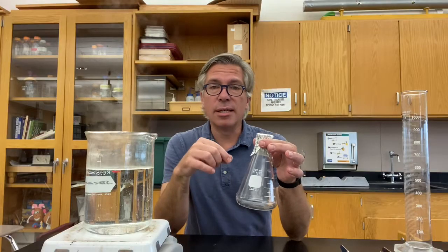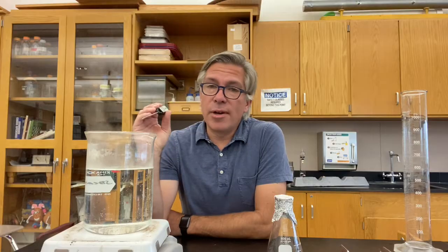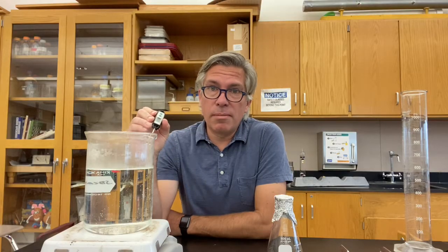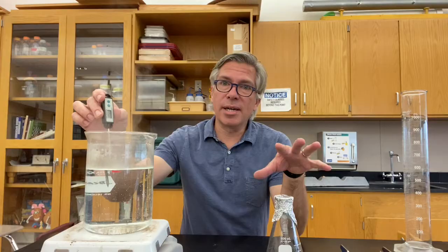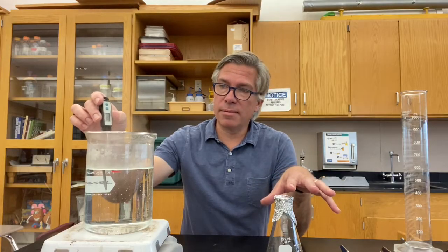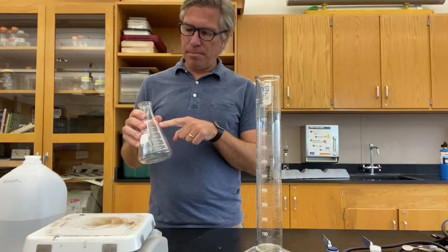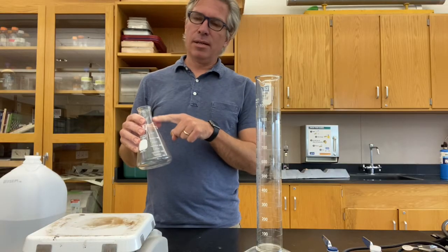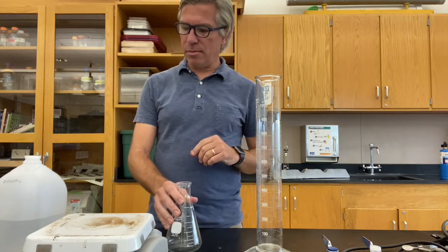The first is to take the mass of that liquid. The second is to verify the temperature of the boiling water bath, which should be close to 100, but it might not be. And we want to know that because that is the temperature of the vapor the moment I took it out of the water bath. Now we need to know the volume of the flask. It says 500, but there's all this space above there that the gas is filling up too, so we need to find the total volume of the flask.